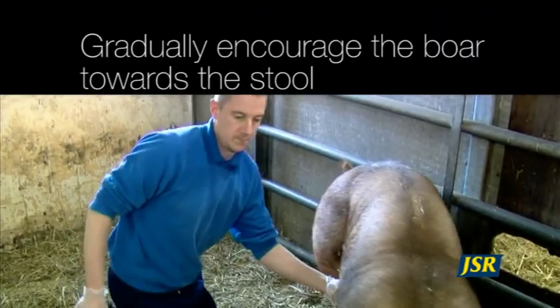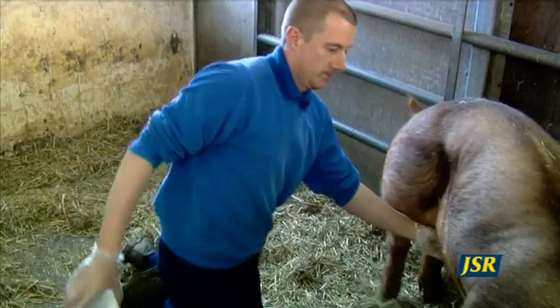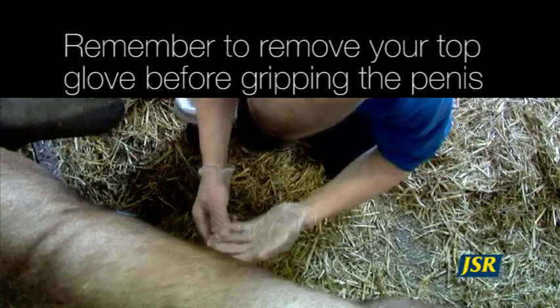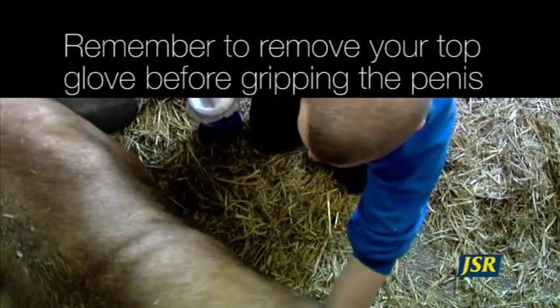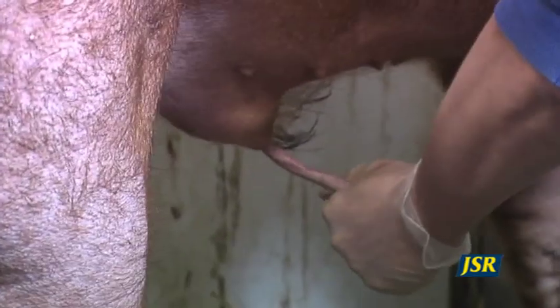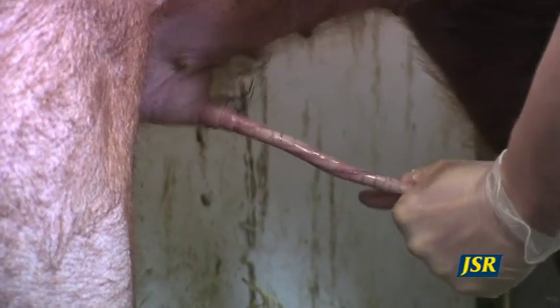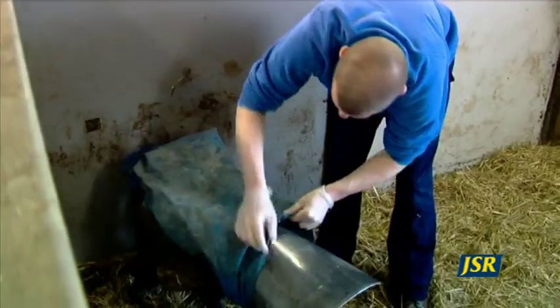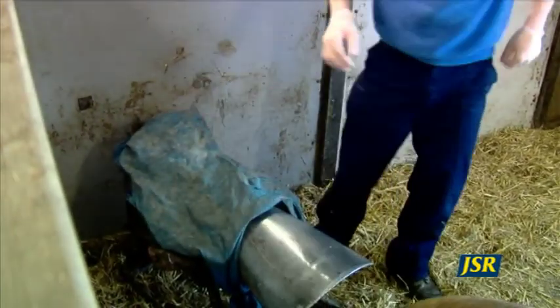Encourage the boar towards the collection dummy and as he begins to produce his penis, remove your outer glove and grip the end of the penis firmly in a fist. This should be enough stimulation to make the boar mount the dummy. If he refuses to mount, there are a few tips you can try to help encourage him. The smell and feel of an old pair of overalls tied around the dummy often does the trick.